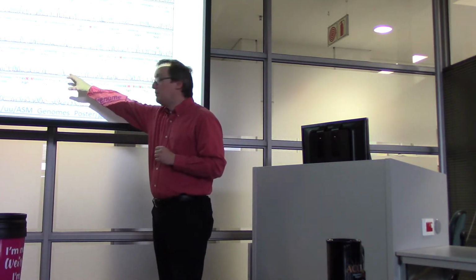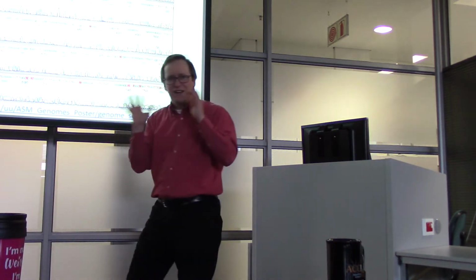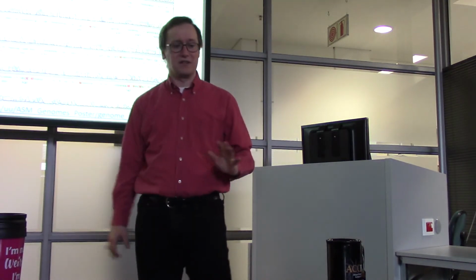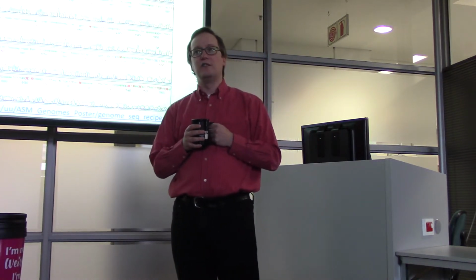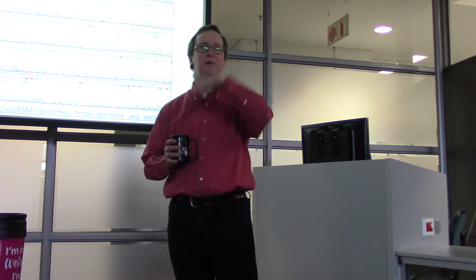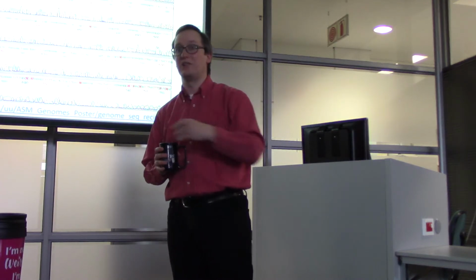So the people behind Phred, one of whom sat on my PhD committee, isn't that strange, were very invested in this problem. They wanted to have a way to estimate a letter-by-letter error rate. Now, from a political perspective, this actually had huge importance because when Congress in the United States funded the Human Genome Project for the United States parts of it, they argued that there should be a level of accuracy associated with it. They didn't want just a bunch of sequence only to discover it was all irrelevant to us. They wanted to have some confidence that the individual base calls actually meant something.